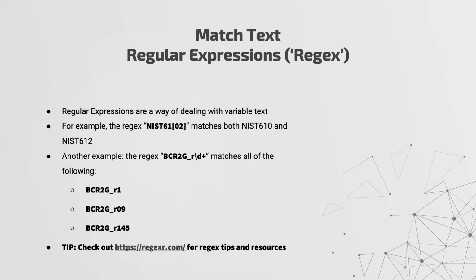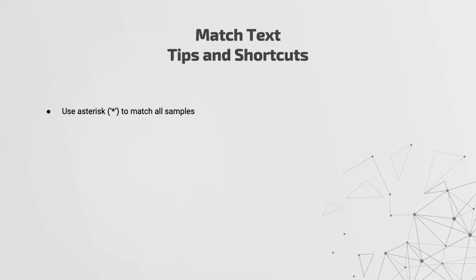We don't have a lot of time to cover all of regular expressions. You don't have to use regular expressions, but if you do want to learn more about it, there's plenty of websites. If you type in regular expression helper into Google, this is the first one that came up for me, but there's plenty of resources out there. The other little tip that I'll bring up is that if you use an asterisk, that's shorthand for saying select everything. That just means match everything. And we'll use that in just a sec.